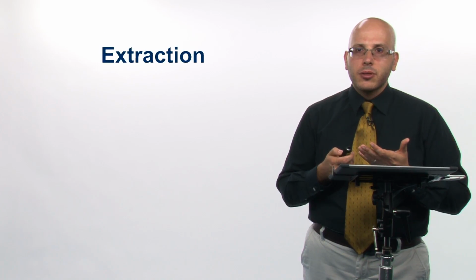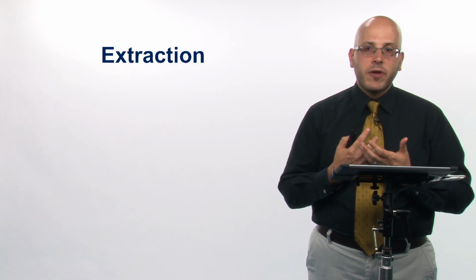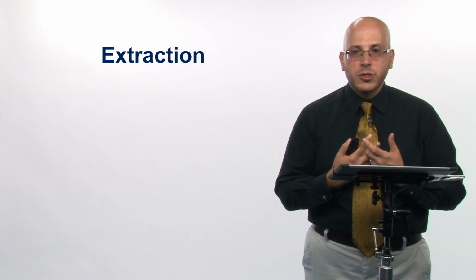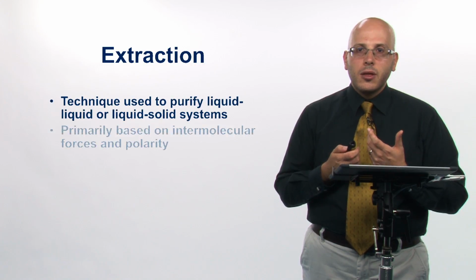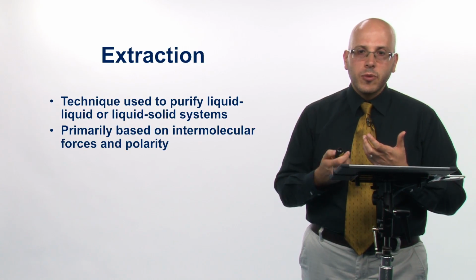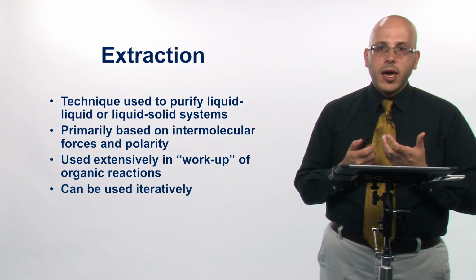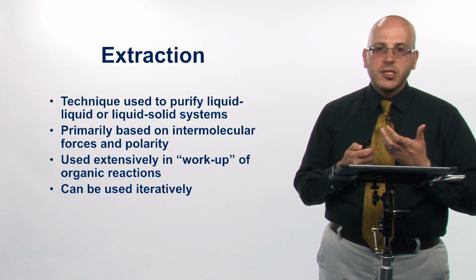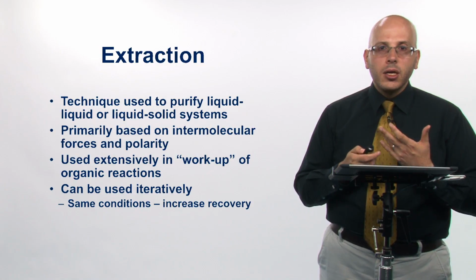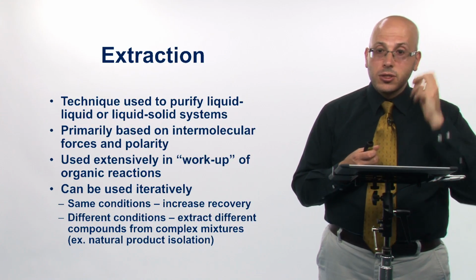And then the last thing I want to tell you about is something called extraction. Extraction is a technique that is used to purify either liquid-liquid or liquid-solid systems. These are based on different intermolecular forces and polarities. They're used pretty commonly in organic reactions to remove substances from each other. Just like crystallization, we can do this iteratively as well. When you do this iteratively, you can do it under the same conditions to get a higher recovery, getting more and more out of your extract, or you can do it under different conditions to get different compounds present. For example, natural product isolation.